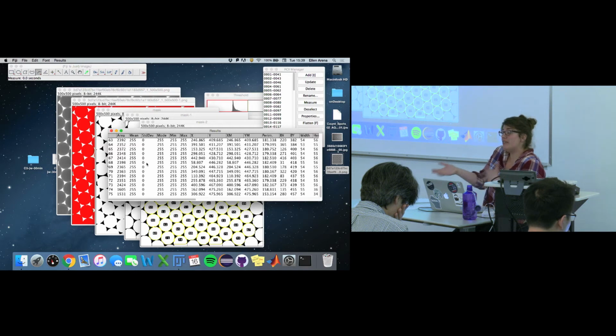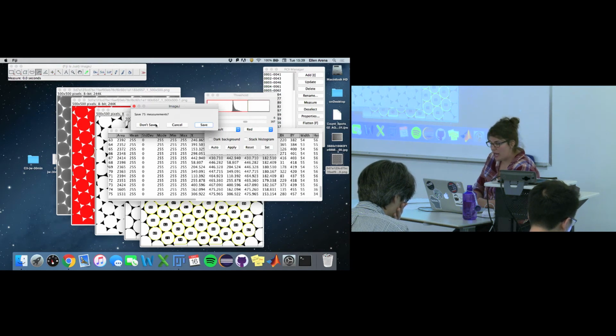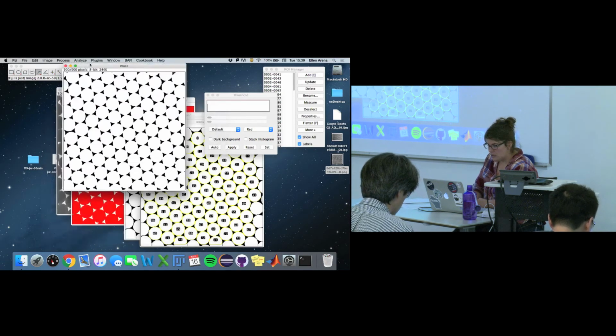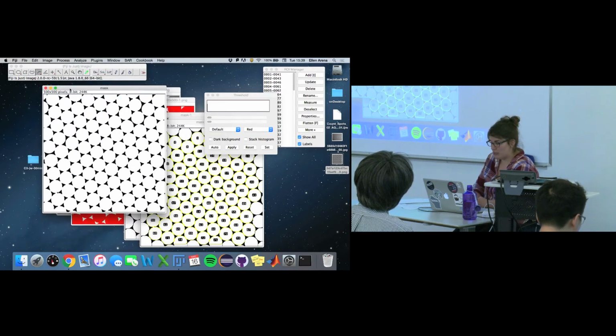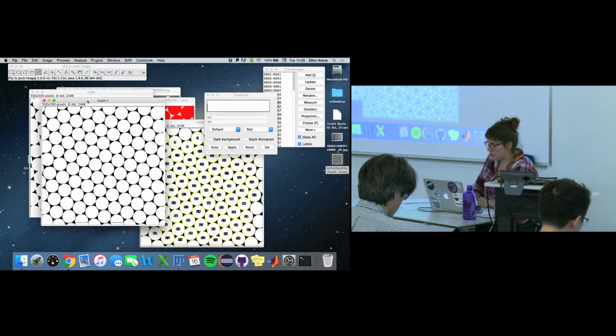I mean, it gives you more information, right? Because you can have the area of your object, the mean intensity if you overlay the ROIs on your original data set, but it also can just count objects pretty easily. And there's actually another option you can do with one of your old mask duplicates. Actually, the one that's watershed. So it's also good that we just duplicated, because I'm going to show you one other option. I'm just going to close the ROI manager though, and close this other one.